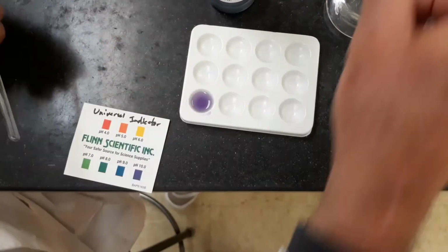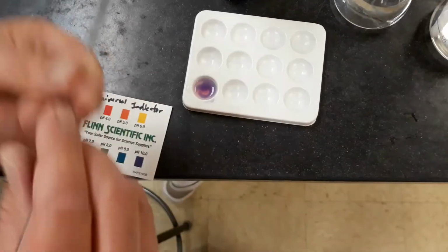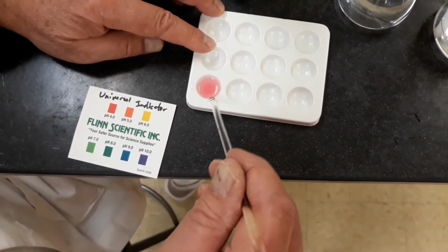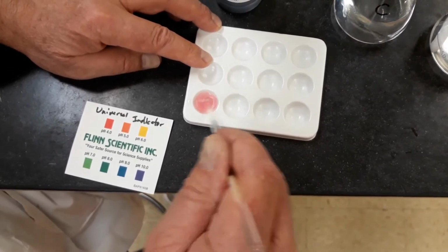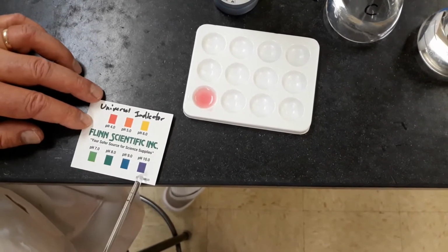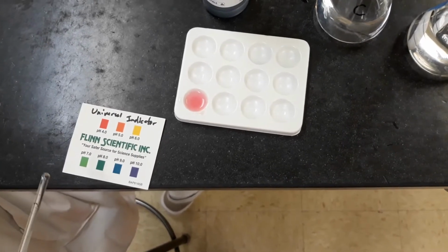It's going to be hard to get it neutral. But you can see somewhere in there, and we can't go half drops at a time. But now we're back to a weak acid. So we went from an acid, past to a base, and then back in here, drop for drop.